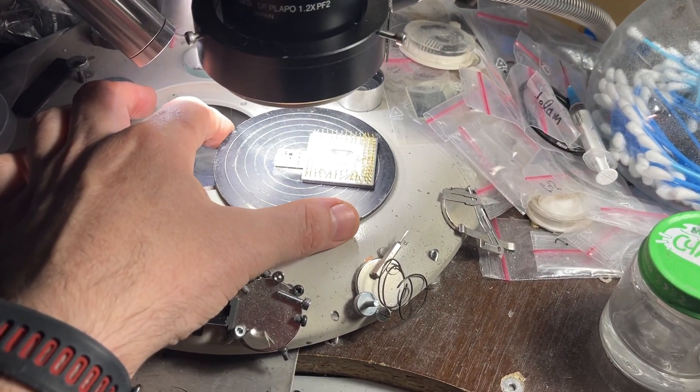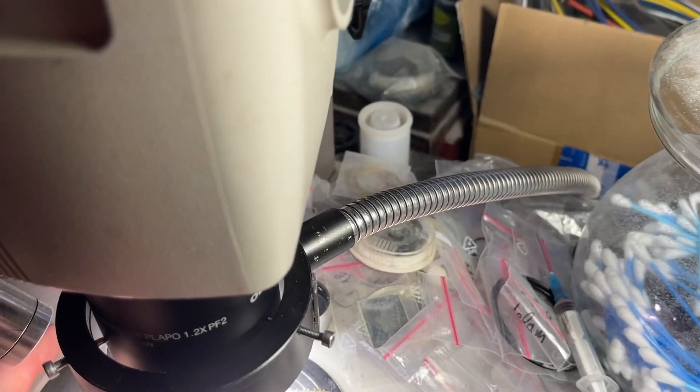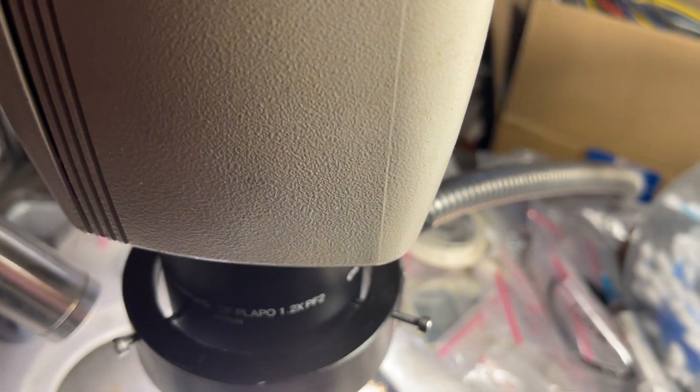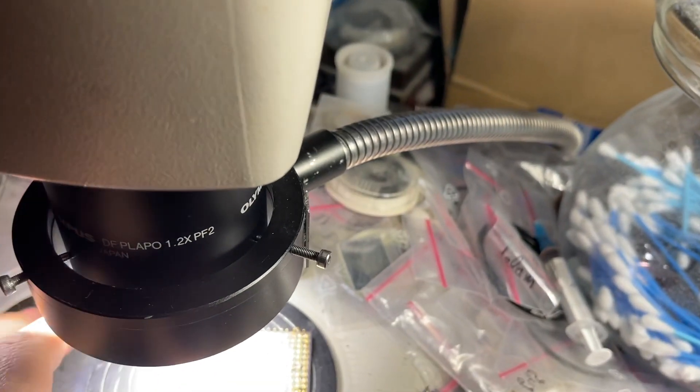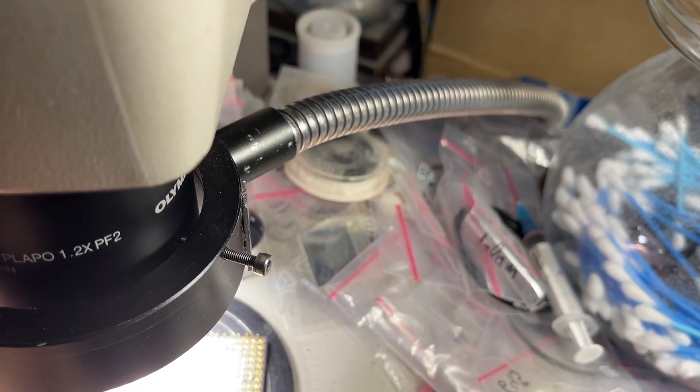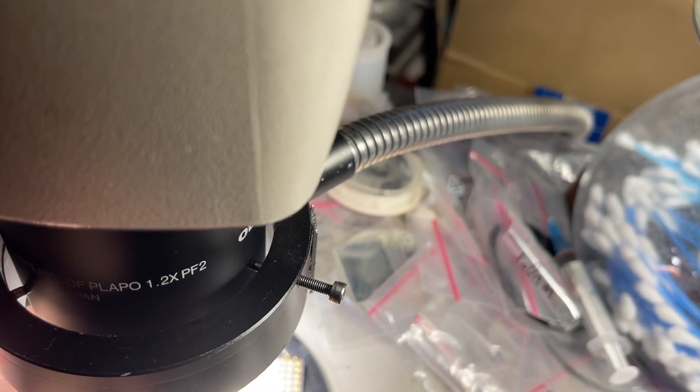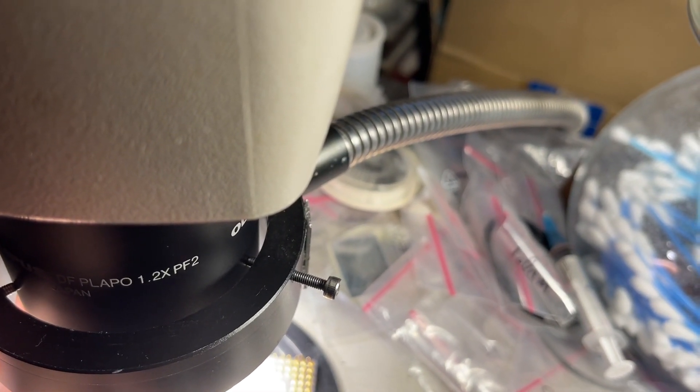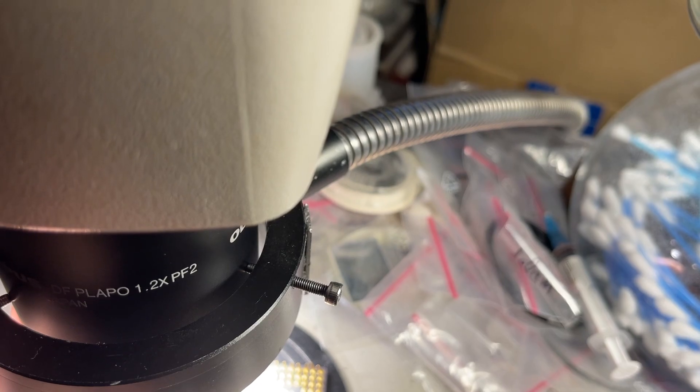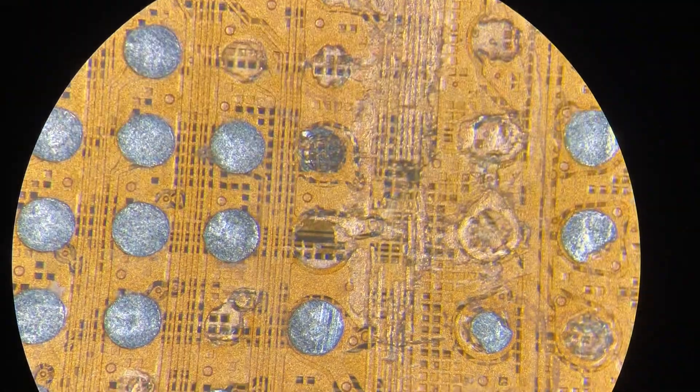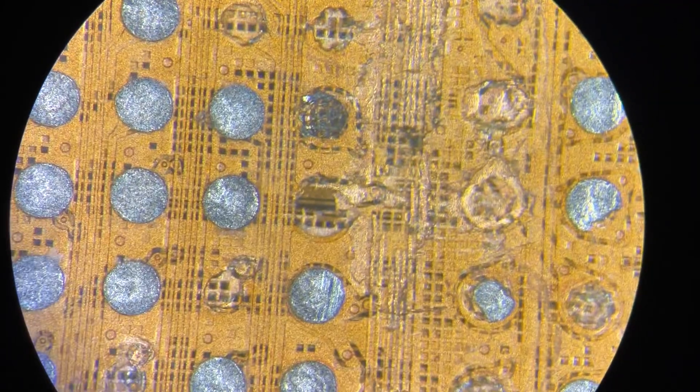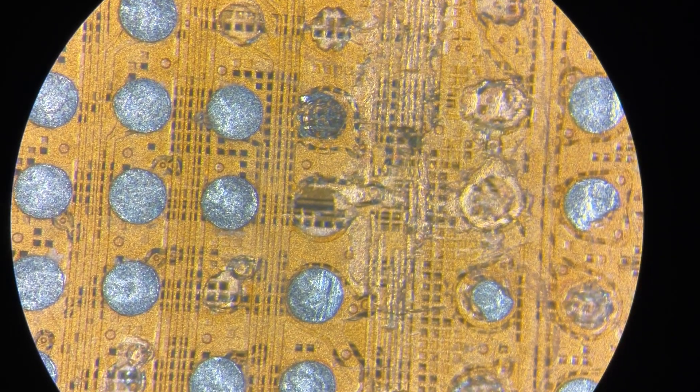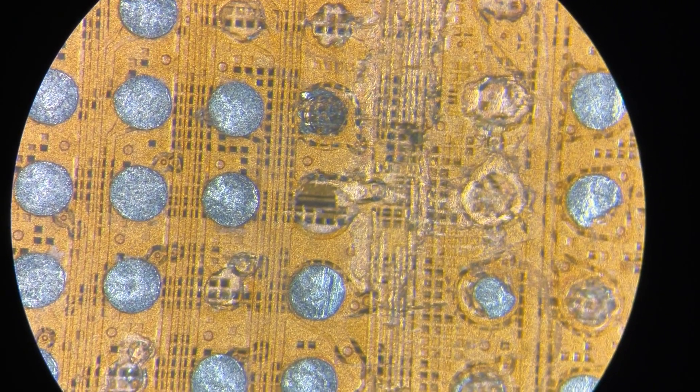Need to put it in proper position. Let me do it. Let me find our usual spot. Okay, I found it. Here's the field of view when we look through a 10x eyepiece at maximum magnification of 75 times.